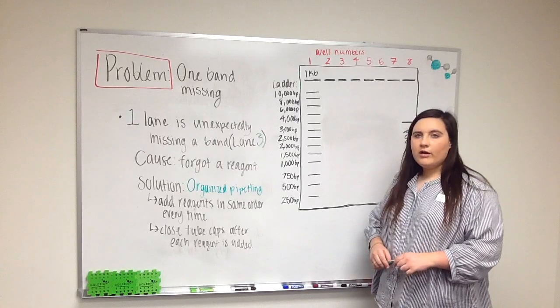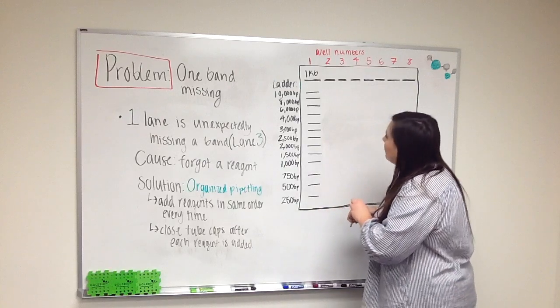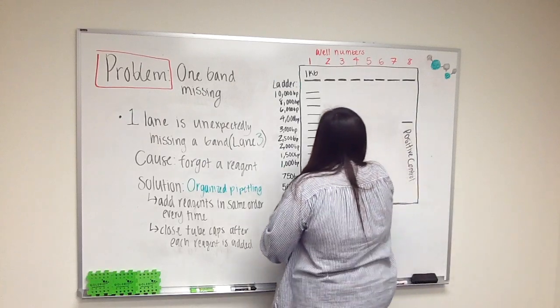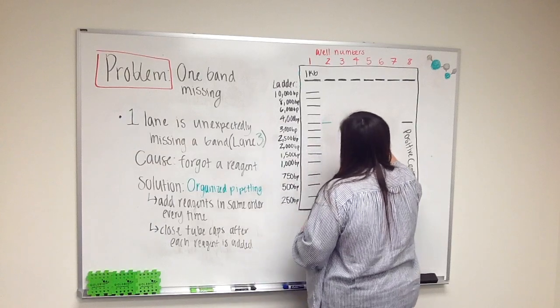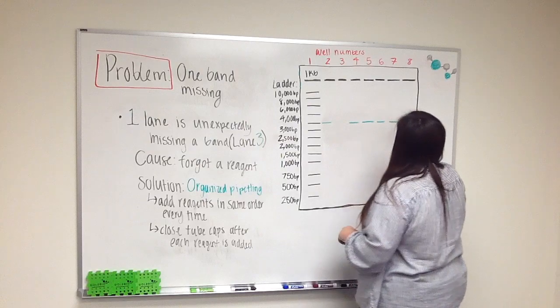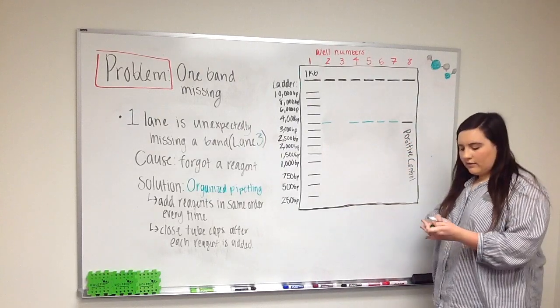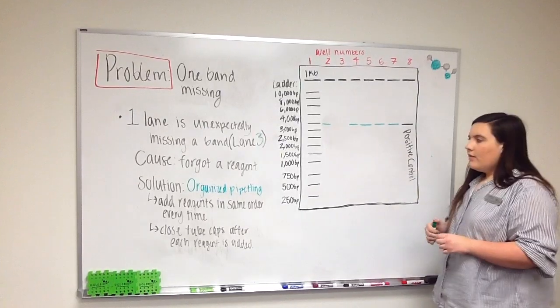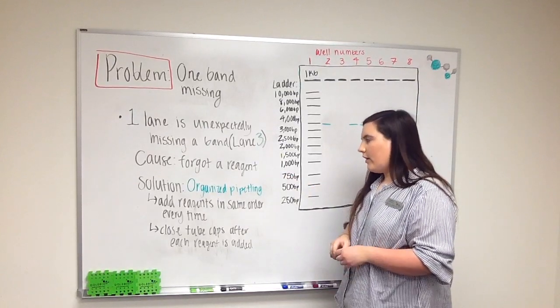The next problem we're going to be discussing is when one band is missing from the gel. How the gel would look is that you would get amplification of the bands that you expected at around 4,000 base pairs, similar to the positive control, but for some reason in lane three you're unexpectedly missing a band. This could be because you might have forgotten a reagent, which happens to all of us at some time or another.